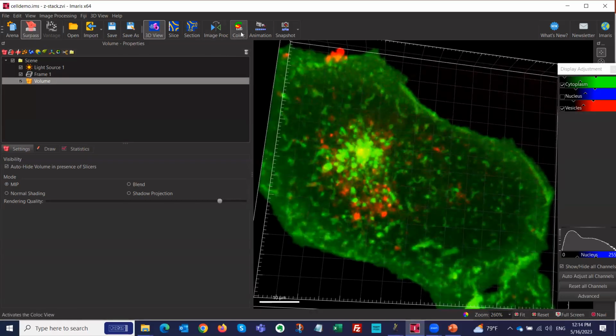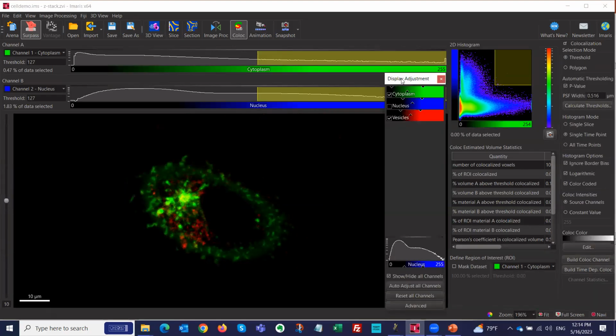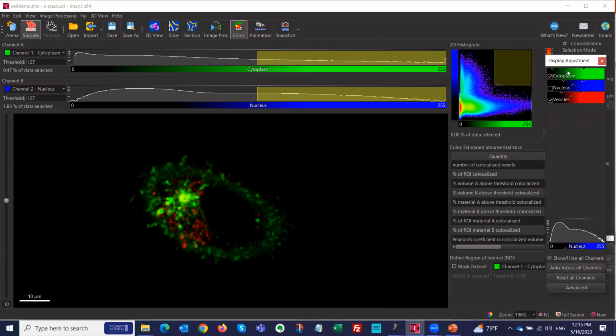Okay. So we have the colocalization tab up here. This is where I'm going to jump in. I don't know if you've ever used it, but typically the first time people see this, they get super scared because there's a lot going on. Let's see what's happening here. When I boil it down to how I do it, because there's a lot of stuff that I never use, how would we do a colocalization here between green and red channel?